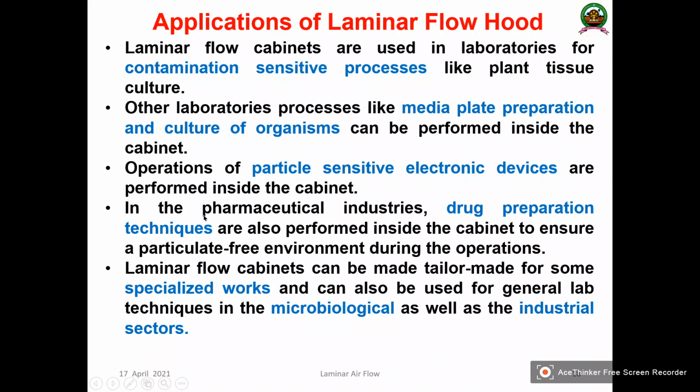Then in the pharmaceutical industry, drug manufacturing techniques and drug preparations are also performed inside the cabinet to ensure a particulate-free environment during the operation, especially vaccines. Nowadays, you know that vaccines are very important at this point of the pandemic. So the importance of laminar airflow is very high here.